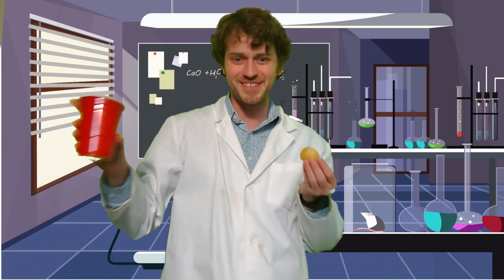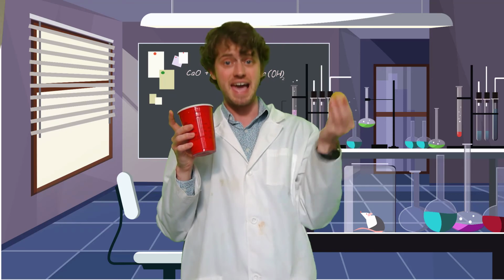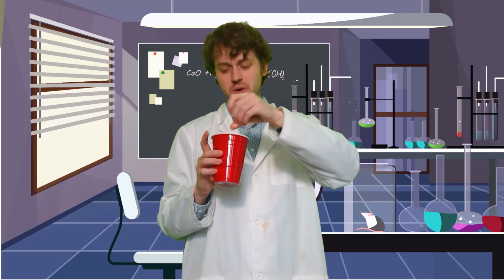And so what I need to do is one more step. I'm going to come back up here for you guys, and I am going to add my egg into some distilled water. So I have added that to the distilled water, and I'm going to let that sit and stew for just a little bit.